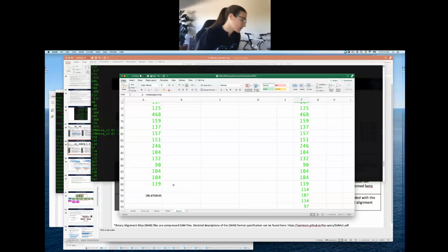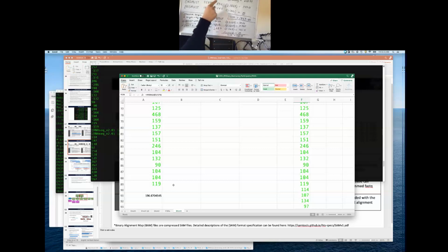And so now if we take those fragment length averages, I want you guys to take a look at this bottom corner here. Sorry, my handwriting got sloppier as I went. So this is now that average fragment length from that Excel file that you're seeing. And again, I have it in the same order as I have up here, the transcripts. So I have the average fragment length for that first transcript right here that you just saw in Excel, the average fragment length for that second transcript in the list from Excel, and the average fragment length from that third transcript in the list.